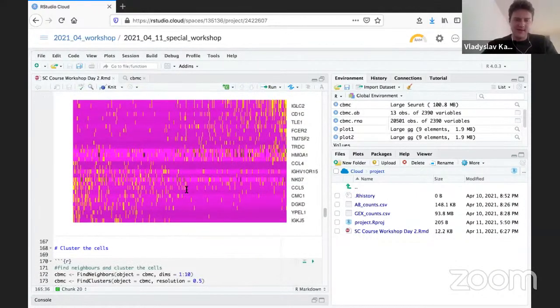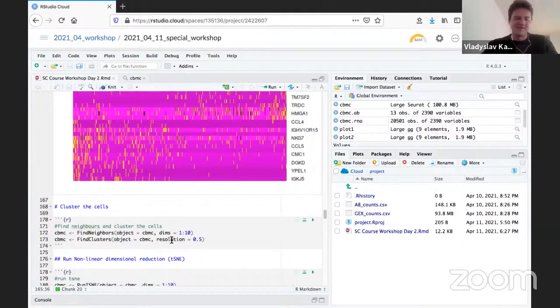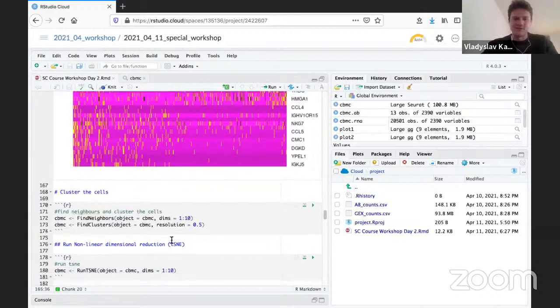So that was our method to determine the number of PCs to use. As Alexander said in the Zoom, so much nostalgia. Yeah, it really is, but it helps every time. You need to check all of your PCs every time you are working with data, because sometimes you take too few or sometimes too many, and it can affect the results that you are going to get afterwards.